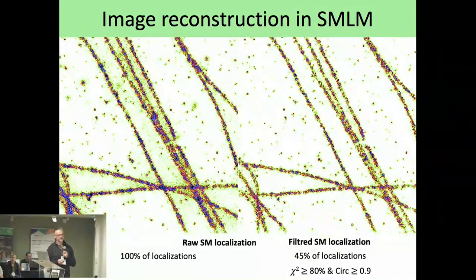Okay, and then if I look at the reconstruction at the end, this is the initial image, and because this is a template that you know, you can see that the artifacts are certainly here. The contrast is not perfect, but you can see there are many localizations that you know are just localization errors, and typically they are in between structures because sometimes there are two molecules and they are not filtered out. And then it's very easy if you take the a priori, and this is also the beauty of single molecule: if you want to be in single molecule, it's very easy to use this a priori and filter out some of the localizations because they don't have the good properties. So here, just filtering out about half of the localizations based on properties that are not the ones we expect for single molecule, you see that we clean perfectly the area where there's high density, and then it's much cleaner. That's very easy, but still.